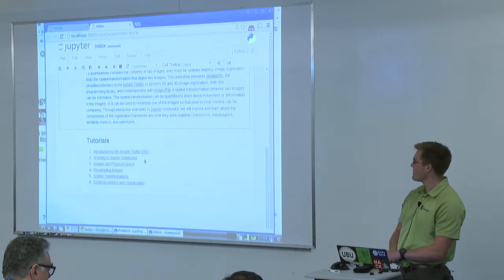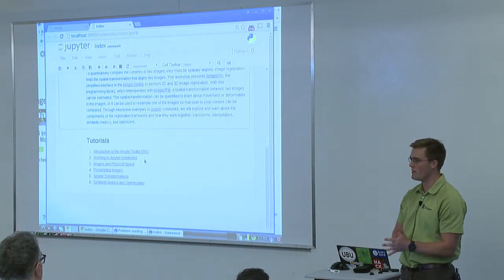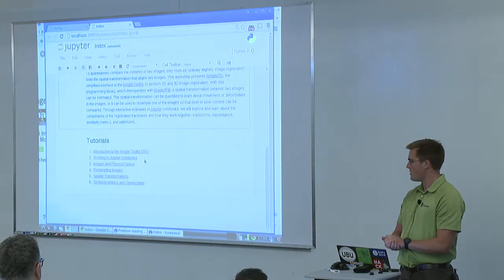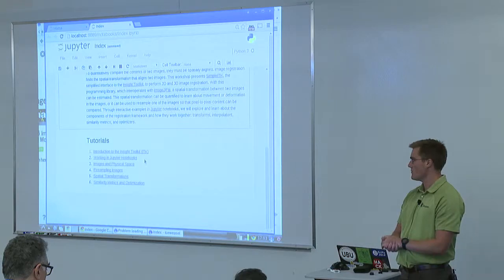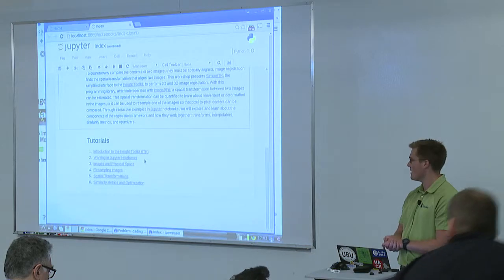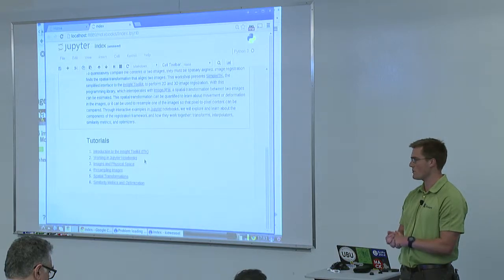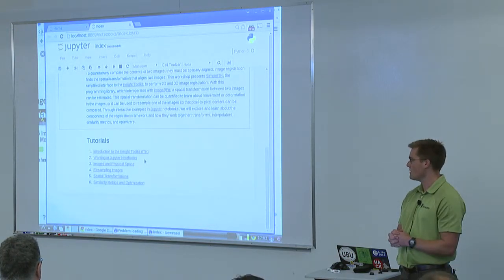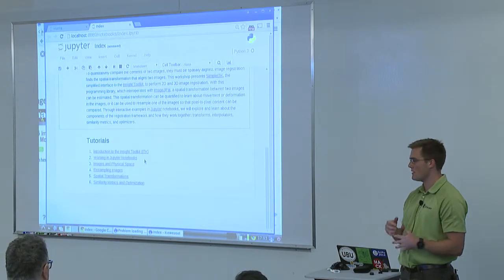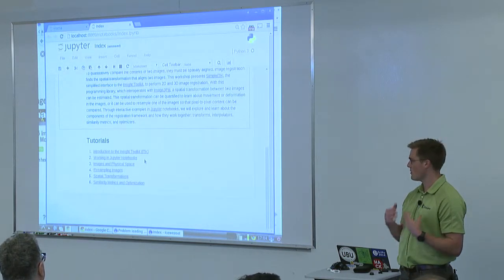The topics we're going to be covering today are images and physical space, and we'll learn a little bit about good practices for working with images and doing operations in physical space. Then we'll go over the process of resampling images and how that works. Then we'll go into a little bit about spatial transformations, which is important for registration. And finally, we'll talk about similarity metrics and optimization. These are all the components and processes that go into image registration.